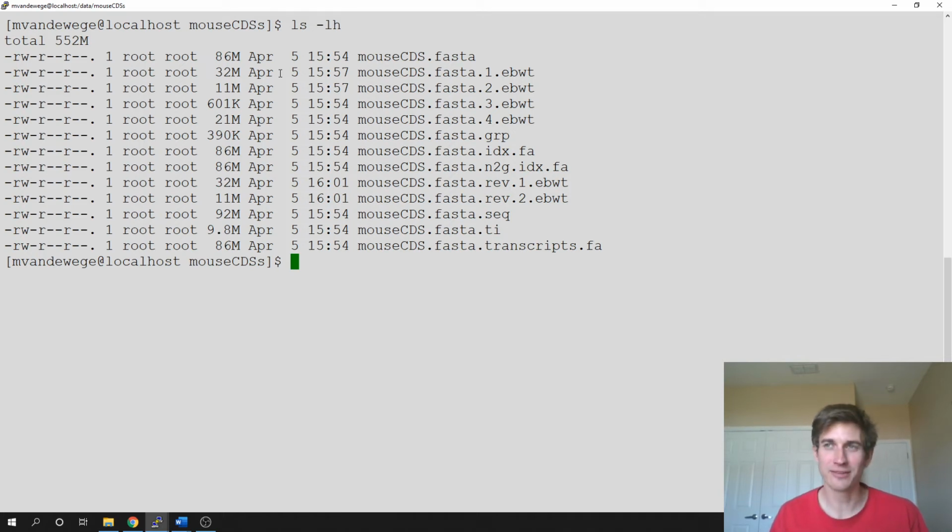There are good mappers. When I say mappers, these are going to tell us which gene these reads came from, or how many reads each gene produced. So there are a handful of really good ones. BWA is probably my favorite at this point, but some of the older ones, Bowtie is still useful. It has its uses. I think Star is another mapper that's getting a little bit more attention. I do like Star a lot.